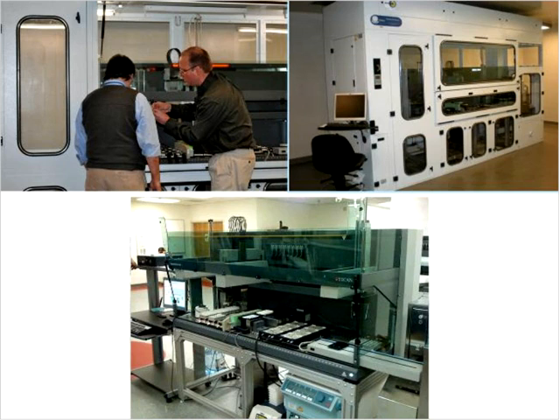You can see here our laboratory director, Lee, and the project manager from Los Alamos, Tracy Erkla, looking at the system. They're working in shirt sleeves because right now there's no infectious agents on that particular system. But you can imagine that when we get to the point of using infectious agents, now we have an opportunity of having a really nice engineering control on top of the personal protective equipment that they would be using for running samples in this facility and on that instrument, the automated system.